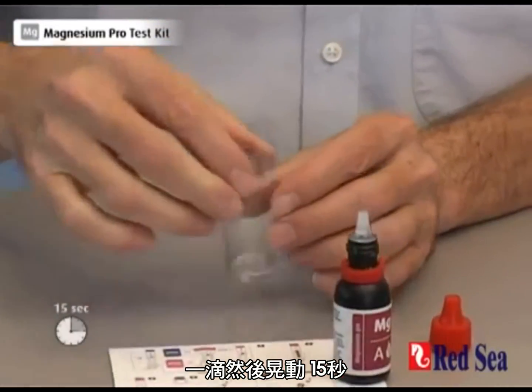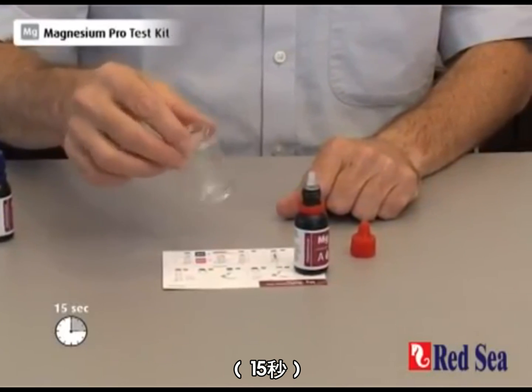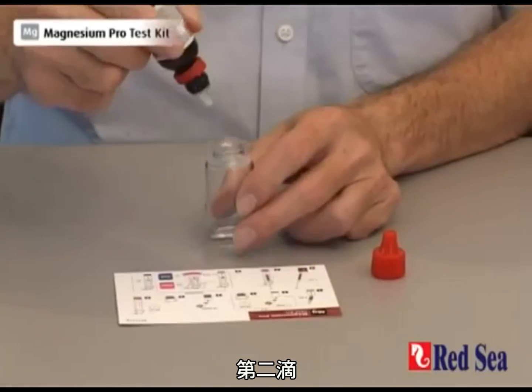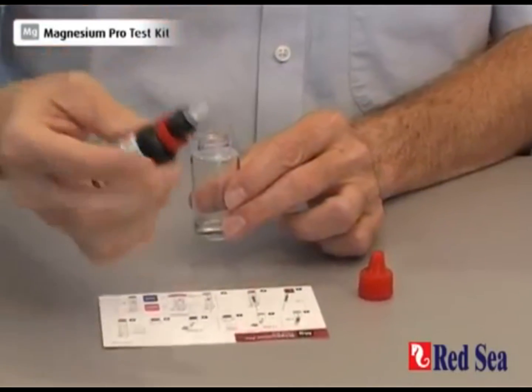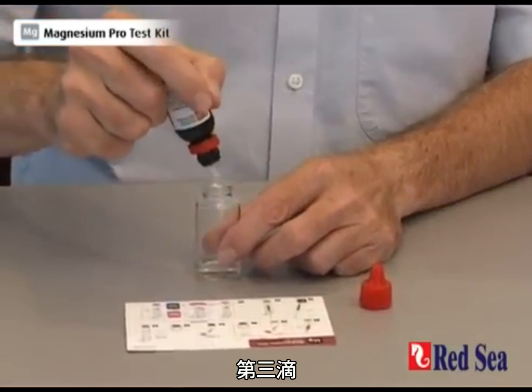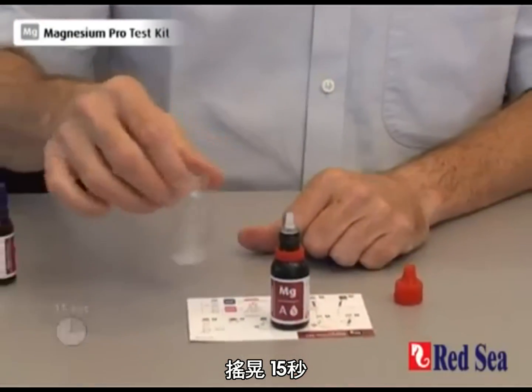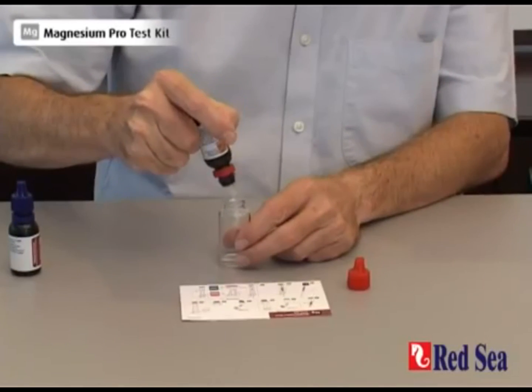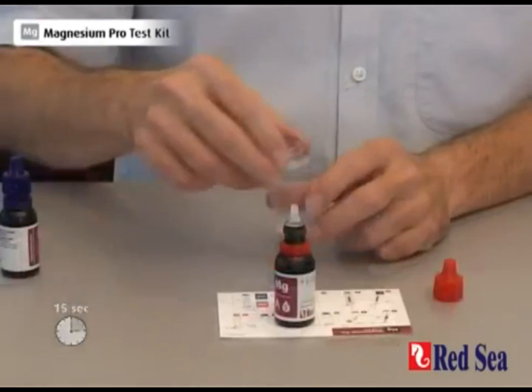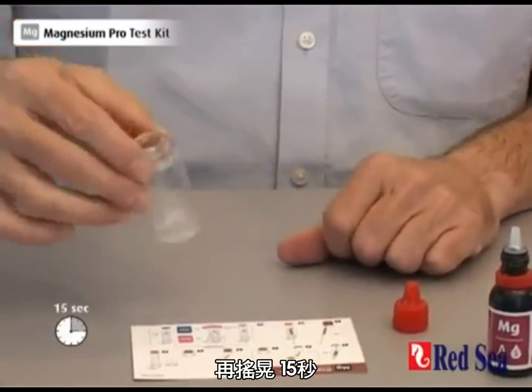Drop number one — shake for 15 seconds. Drop number two — shake for 15 seconds. Drop number three — shake for 15 seconds. Drop number four — shake for 15 seconds. Drop number five — shake one more time for 15 seconds.